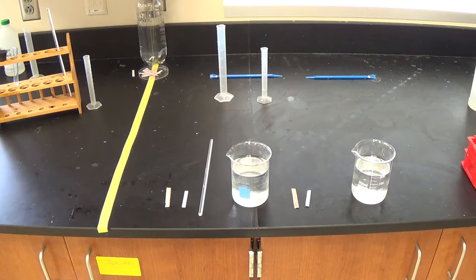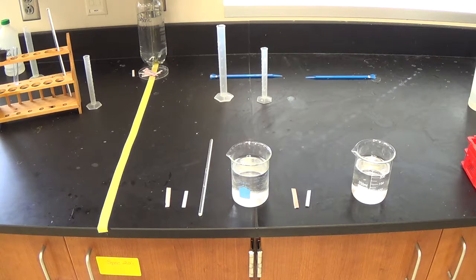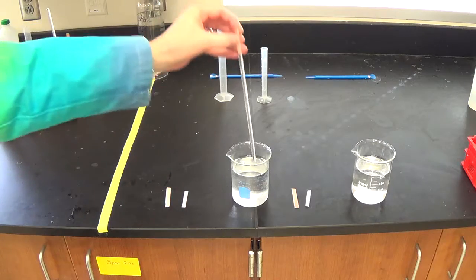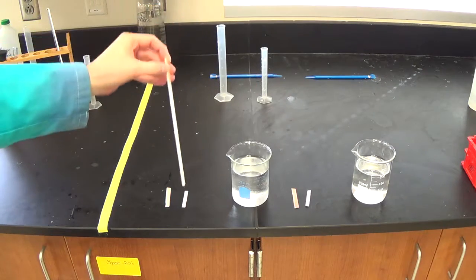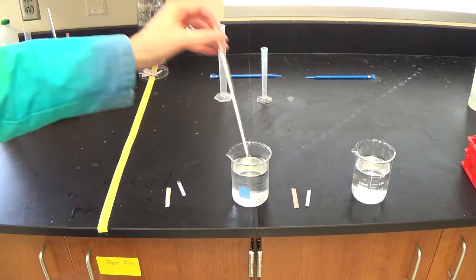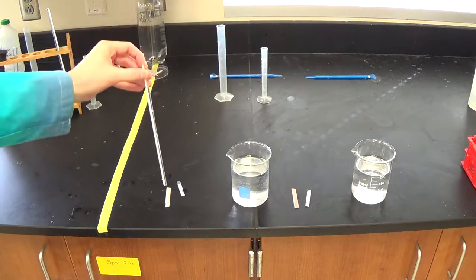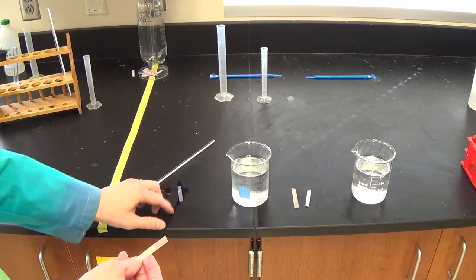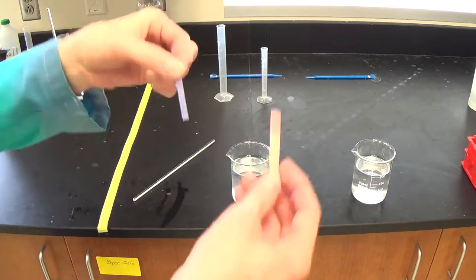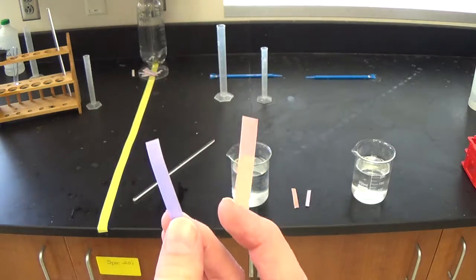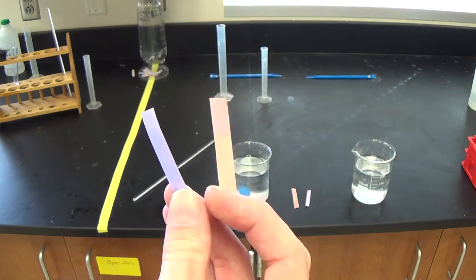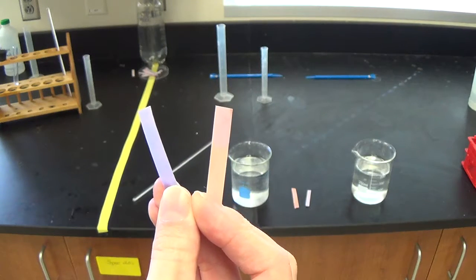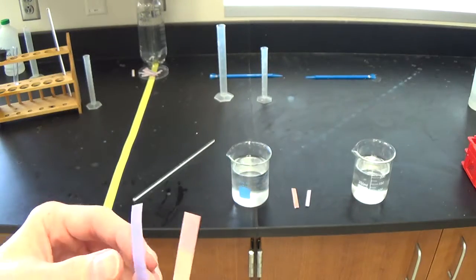We're going to start with Reaction 1. In Reaction 1 I'm starting with a beaker of water. Before I begin, I'm going to test this water with litmus paper. We're going to do the proper chemical procedures of dipping the stirring rod in and tapping that to the test papers. You can see the blue paper stayed blue and the red paper stayed red. That combination of no change lets me know I have neutral water, which is a very good thing considering it came out of the faucet.